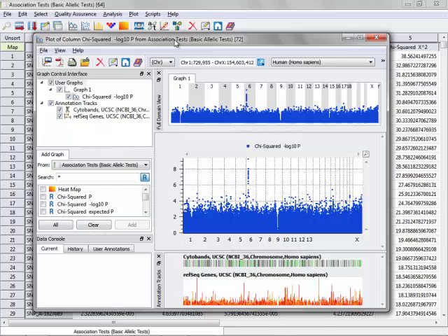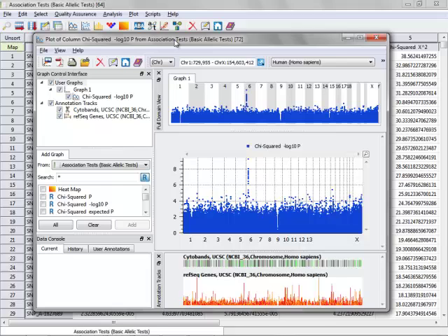This will then bring up the genome browser. And you can see that you've got a standard p-value plot here, which is ordered from chromosome 1 through X.